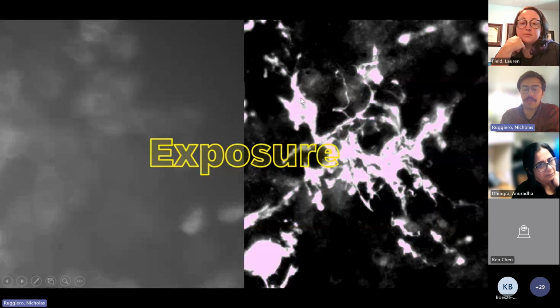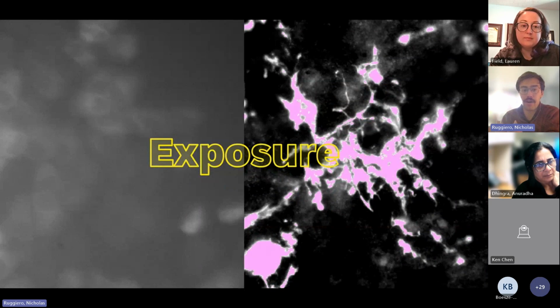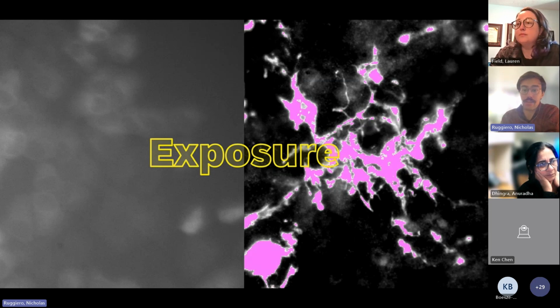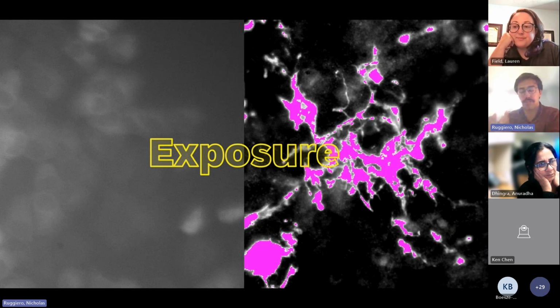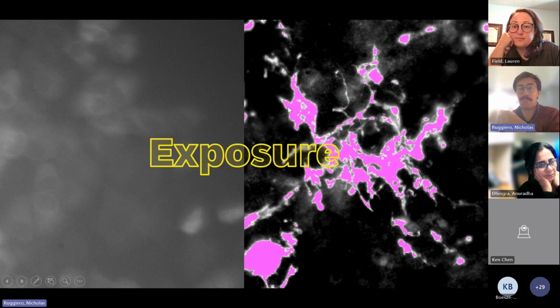The best way to consider exposure and ways to adjust and account for it is making sure that we have good exposure in our image. For underexposure, usually that means taking longer exposures. And for overexposure, usually that means taking shorter exposures. The only other way that we can really account for this is, again, with camera technology. There are cameras that have really high dynamic ranges, so we can capture really bright and really dark pixels at the same time. There are cameras that have much higher quantum efficiency, so they're much more sensitive, and different camera technologies that we may need in order to pull the data out. That's not to say that we can't ever get data from images that aren't perfect. We certainly can, but these are just things to think about.